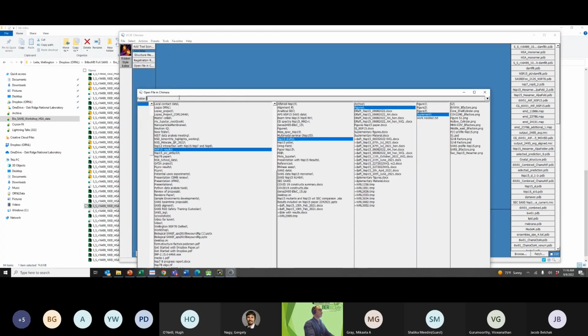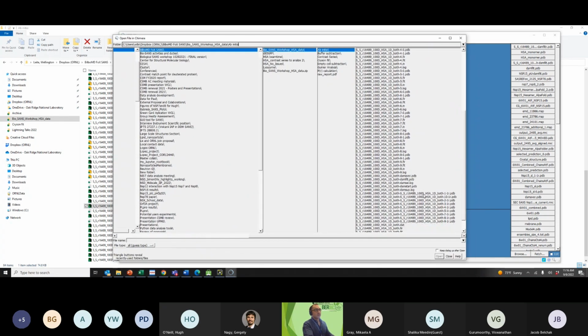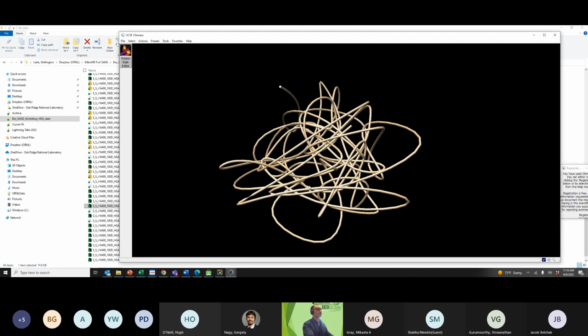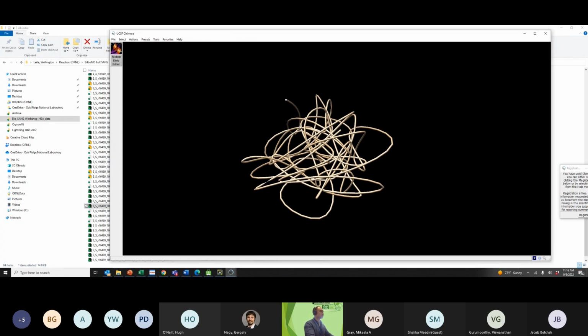Open. Okay, the file is the PDB. Okay, again, it does not look like anything that is interesting, but let's make that difference. So you can come here in tools, general controls, command line. You probably have the command line on your Chimera. I'm not sure what version of Chimera you have, but it's similar. You may have a command line on the bottom side of the Chimera.